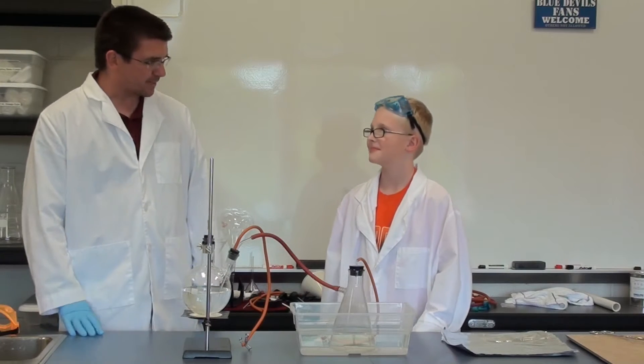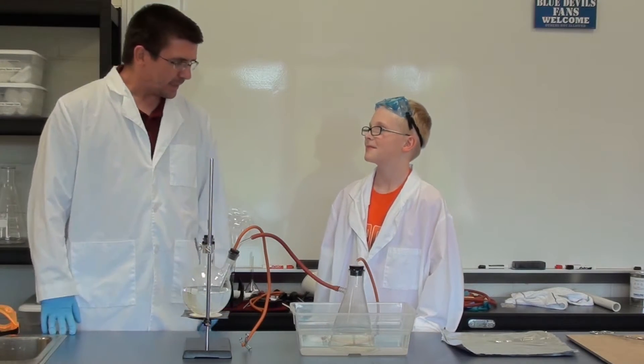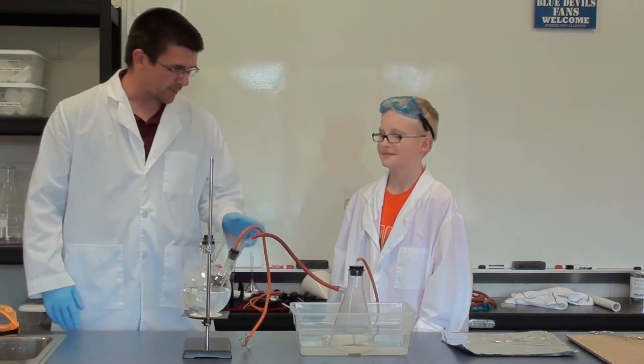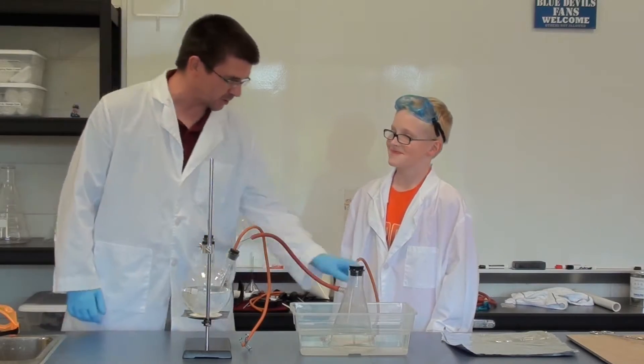Gideon, we're going to be looking at some hydrogen gas and some of its interesting properties today. To get some hydrogen gas, we're going to need a chemical reaction between hydrochloric acid and aluminum. For that, we're just going to use a piece of aluminum foil.